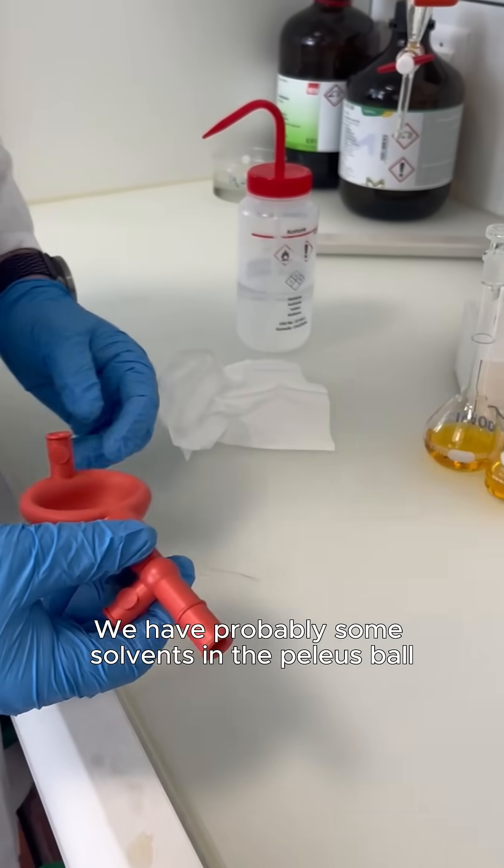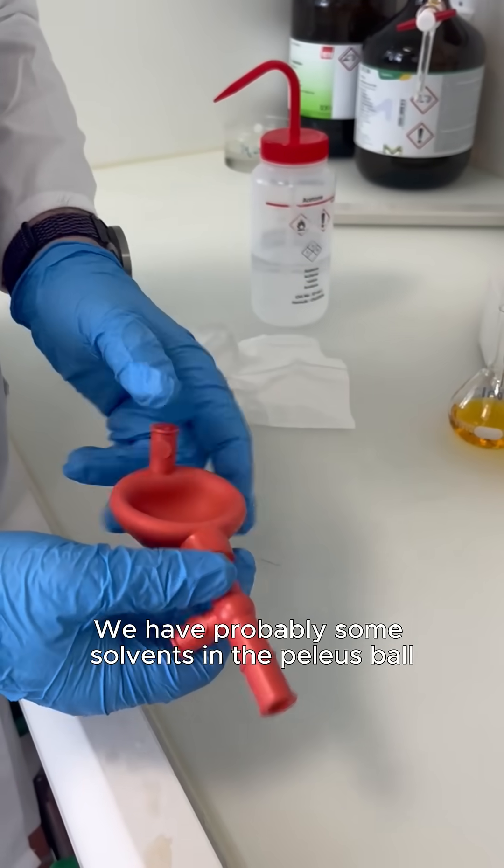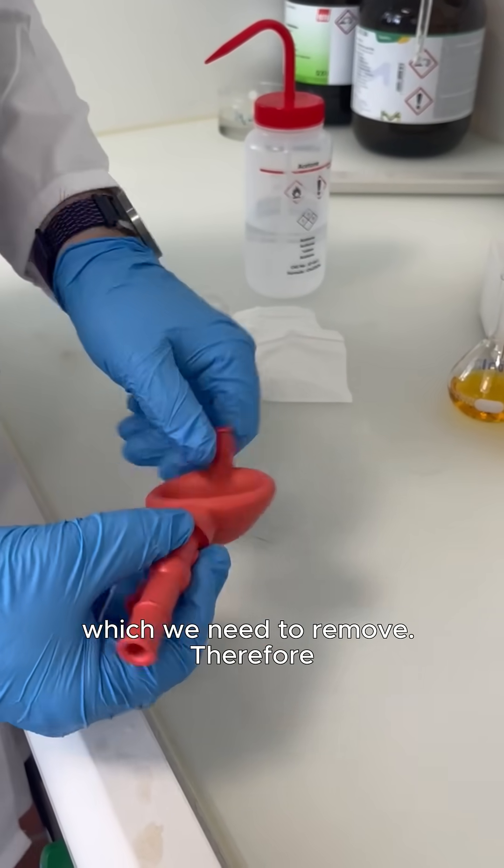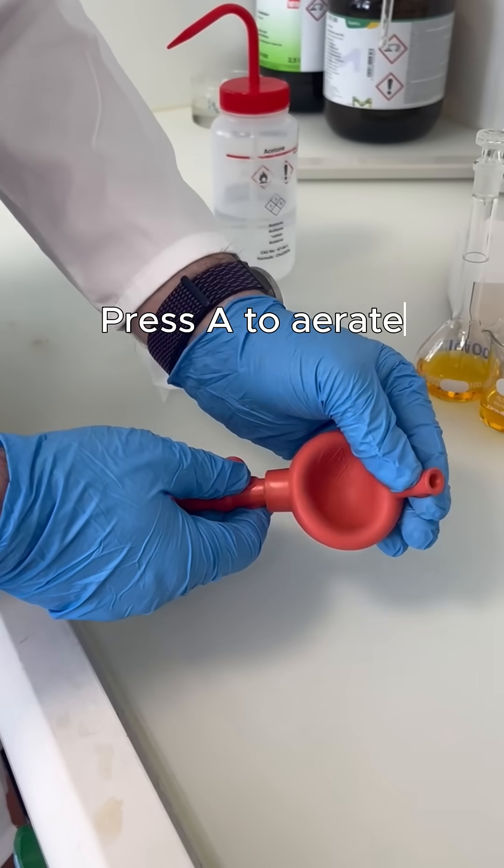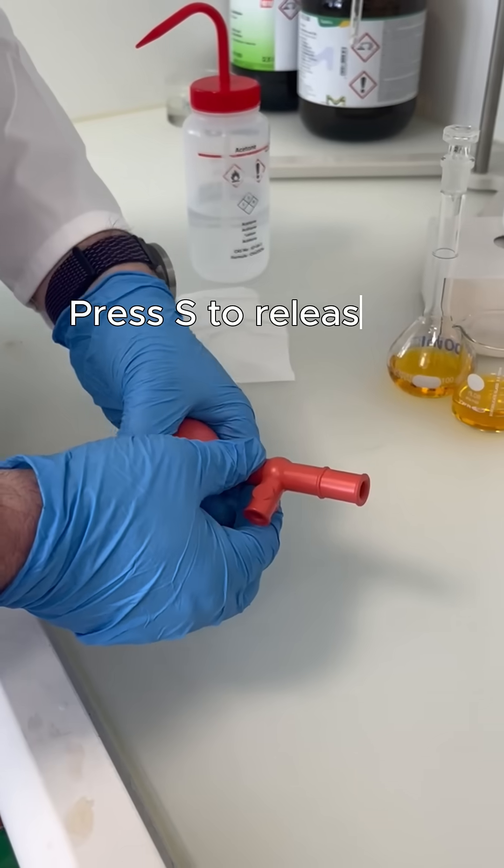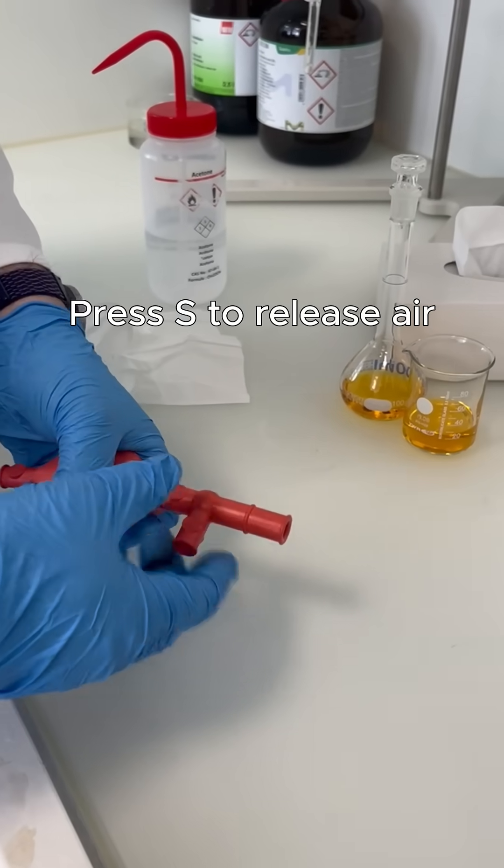We probably have some solvents in the Palaeus Ball which we need to remove. Therefore we press A, aerate the entire Palaeus Ball, and remove the air again via the S.